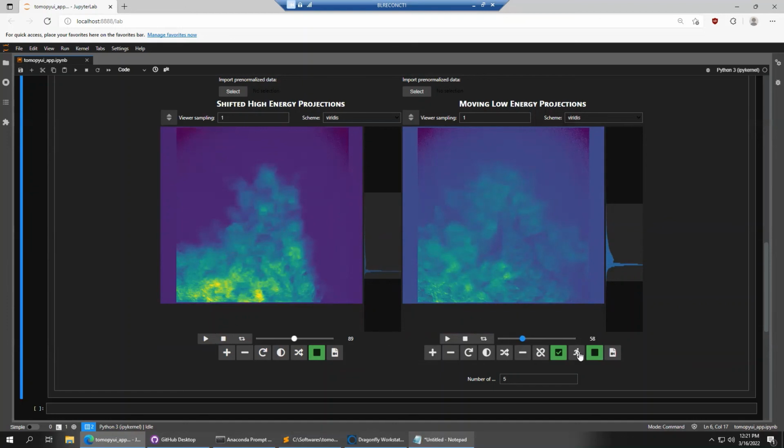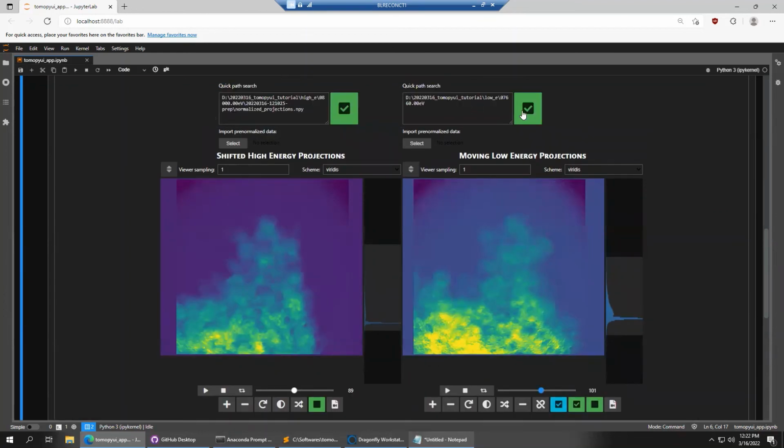And we want to align this jittery data set to our aligned data set. So we can do that. Typically, I can use this full data set without doing anything. So I'll just click this button. Behind the scenes, it's actually doing a median filter to find the shifts of this compared to this. And so now what we have is a somewhat aligned data set. You can see that it screwed up at some point of this alignment, but throughout the full one, it's relatively good.